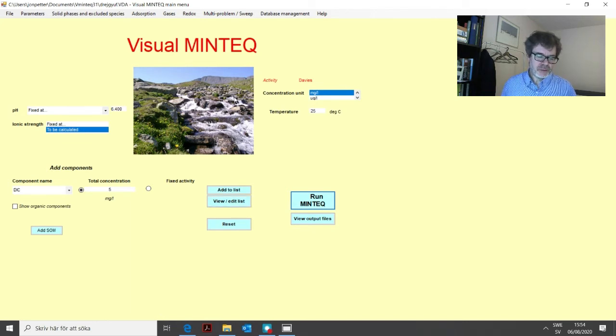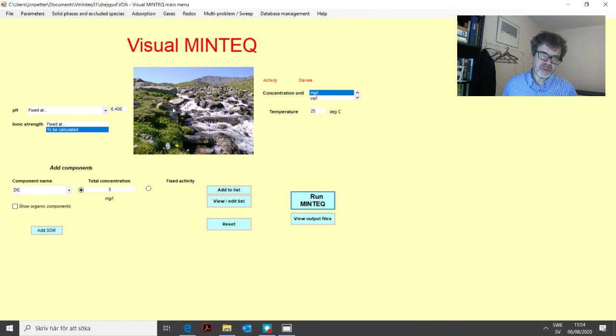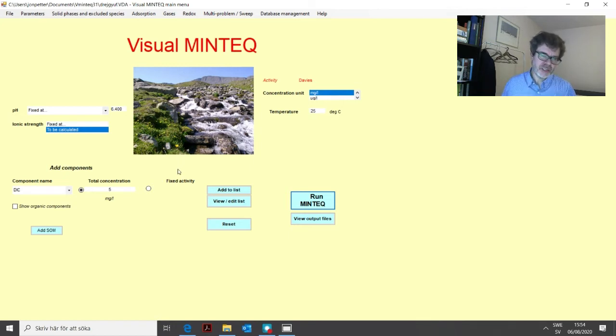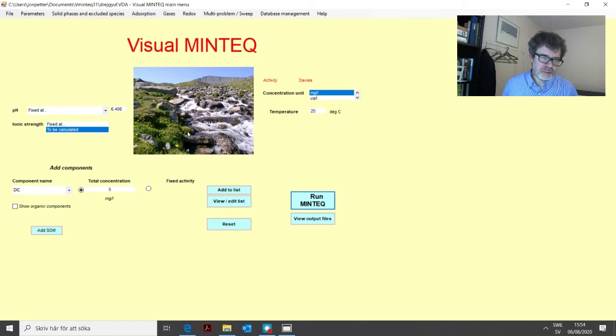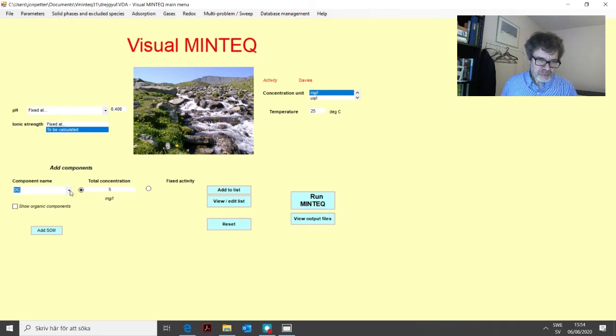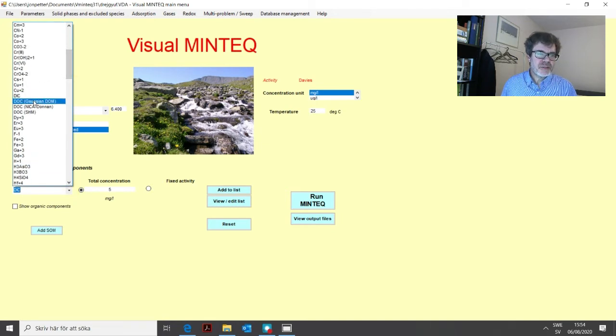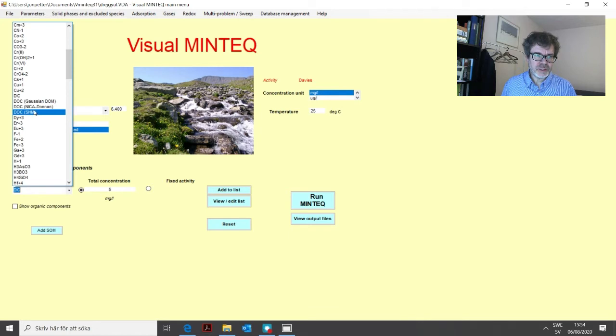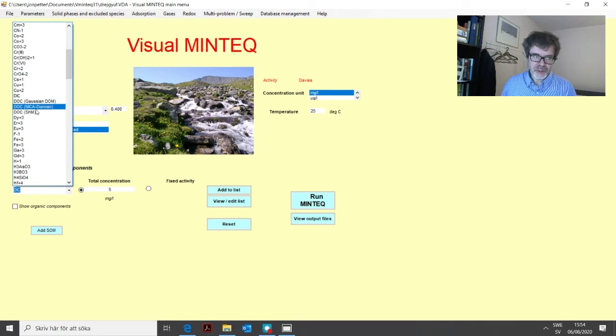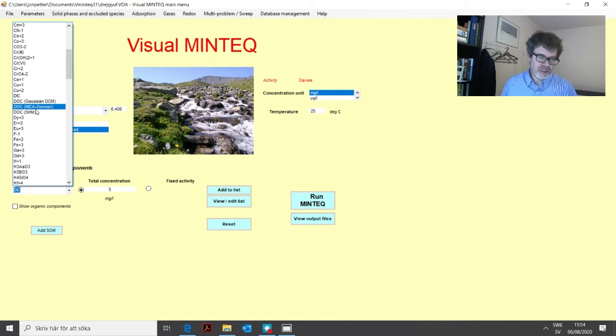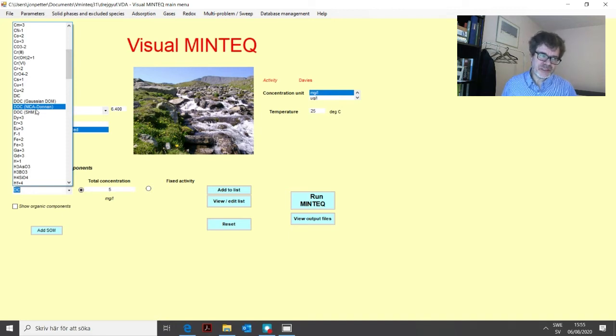And then we also have organic matter, which can be quite important for, for example, metals. If you have metals in the water, because this dissolved organic carbon can complex different metals quite efficiently. So how to add dissolved organic matter to the problem? Well, you use actually this component list to do that. And if you go in here, you see actually three different components for DOC. So you have to choose one of them. And these three represent different sub-models for handling dissolved organic matter, which is, as you might know, quite complex in structure and also very heterogeneous. So it's not easy to treat it in a traditional chemical equilibrium model.